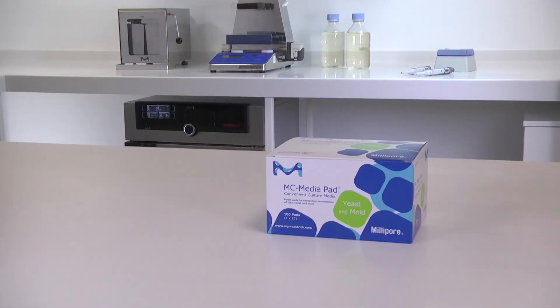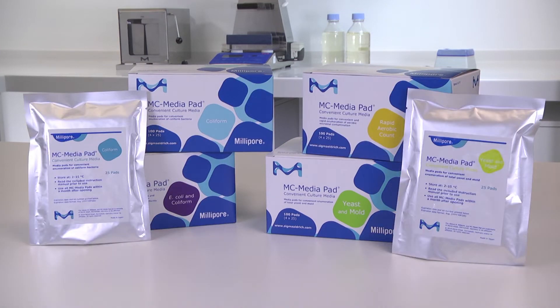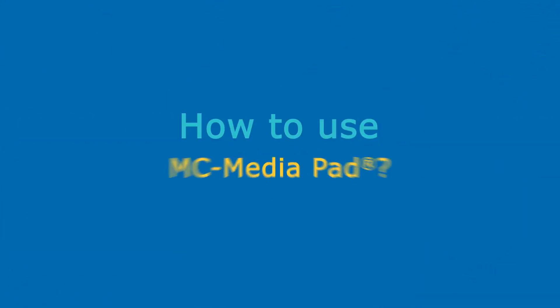MC MediaPad is a convenient culture media method which can improve the indicator organism testing workflow in your routine analysis. In this video, you will learn how to use this method.